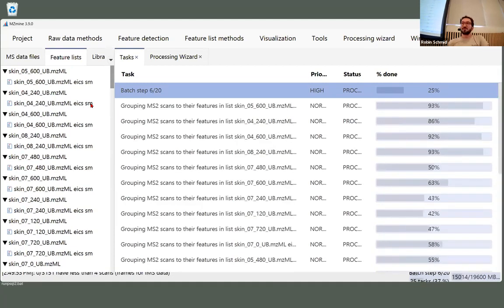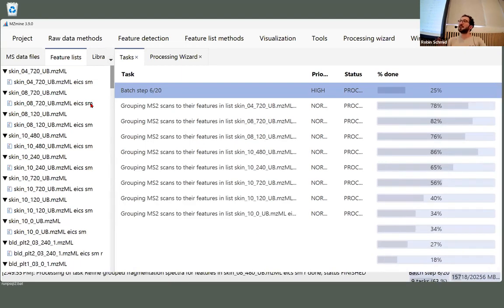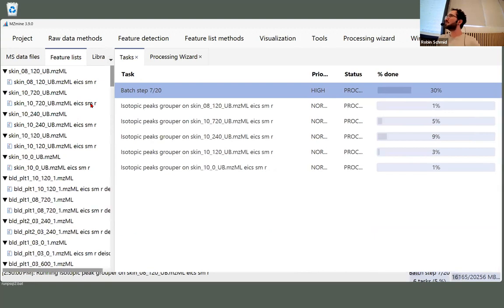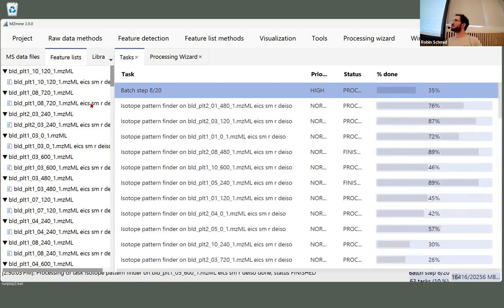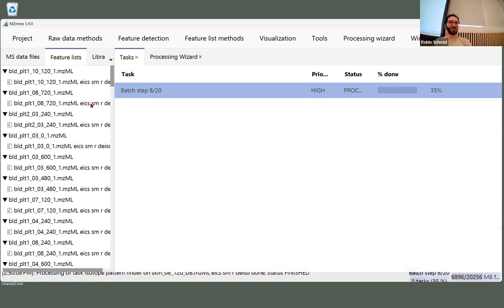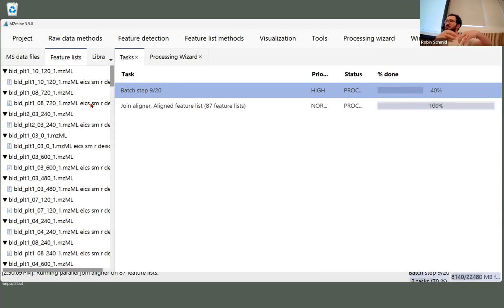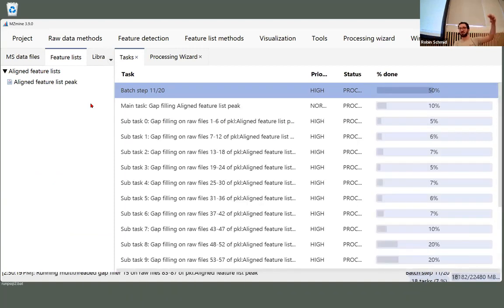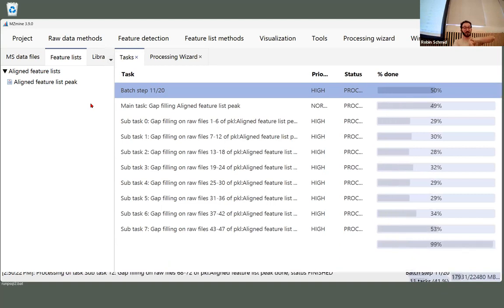And some questions that always come up is, MZmine eats so much memory. So maybe some of you ran into some memory issues in the past with MZmine. So there's 2 things to it. Of course, especially in the alignment of samples, that's a very memory hungry step, especially because there's a lot of features and a lot of samples that you want to align your features in.